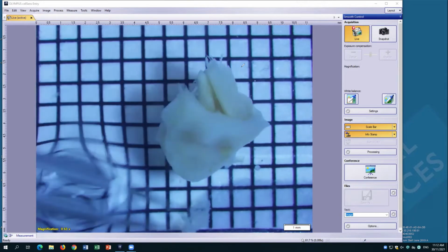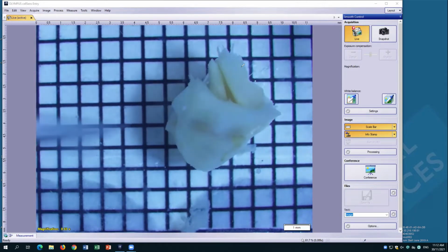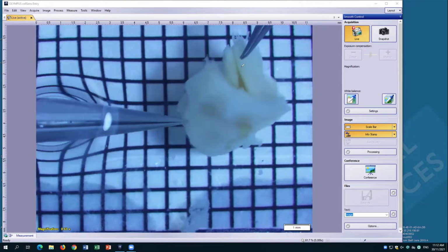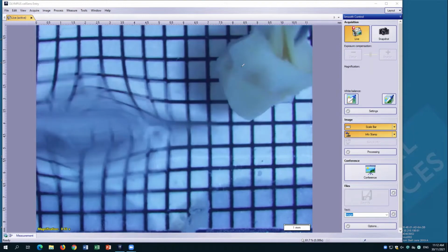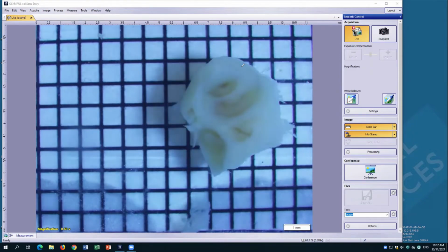So this is a human cochlea. It's been processed in a pretty much analogous way, but the bone's been trimmed quite extensively. So I might just flip it around. Okay, so I think you can see the turns. So this part has been sectioned, and you can hopefully see the cochlea turns like that. So this is a human cochlea.